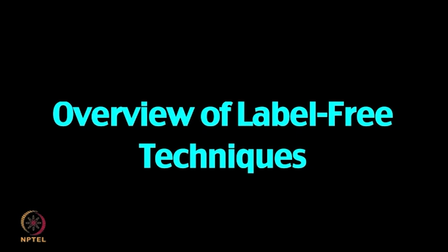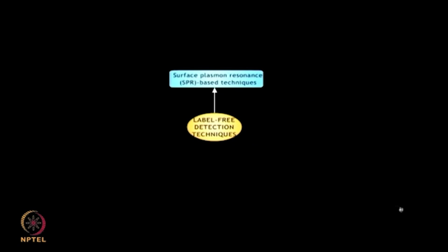They do not involve laborious procedures, but have their own pitfalls such as sensitivity and specificity issues. So, let us first talk about surface plasmon resonance based techniques.